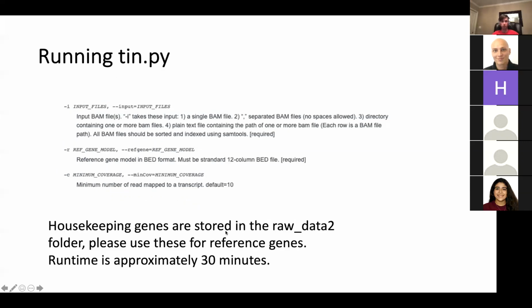Yeah, so Python goes first. Anytime you're running software, you generally put the software name first. Like STAR would go first. Here, Python goes first. When you call Python, you always want it to be followed by a Python file.